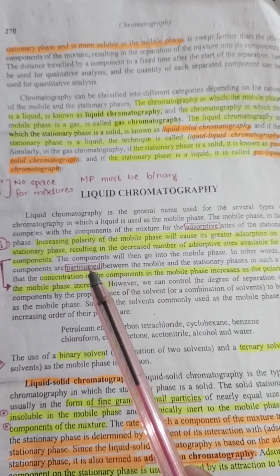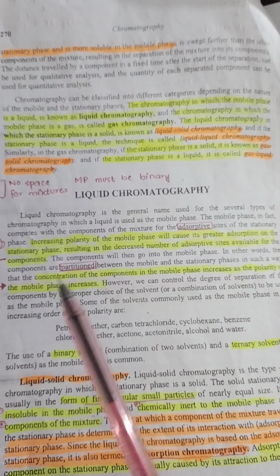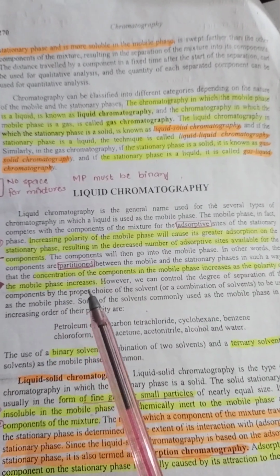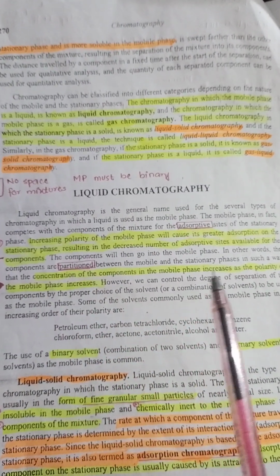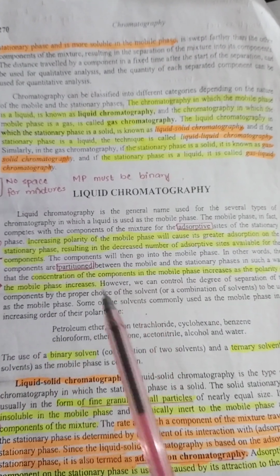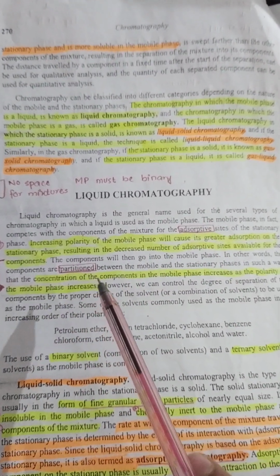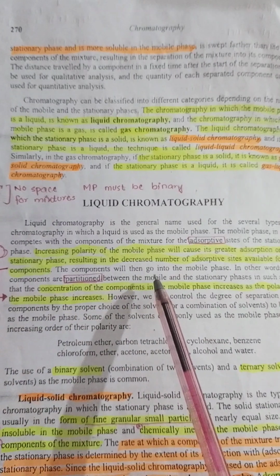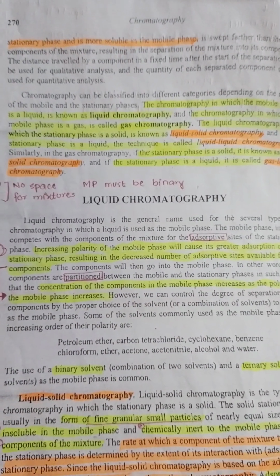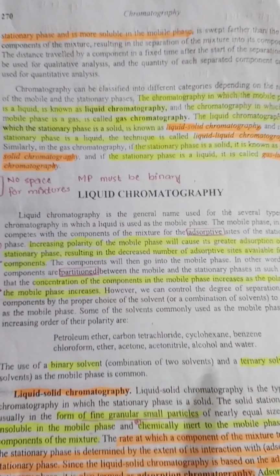Next, the component will then go into the mobile phase. In other words, the components are partitioned between the mobile phase and stationary phase in such a way that the concentration of the component in the mobile phase increases as the polarity of the mobile phase increases. Now there are two principles: first is adsorption and another is partition. In partition chromatography, the separation of the components depends on their polarity.